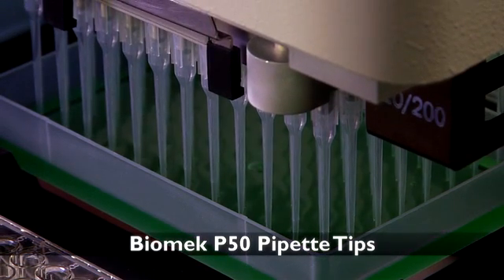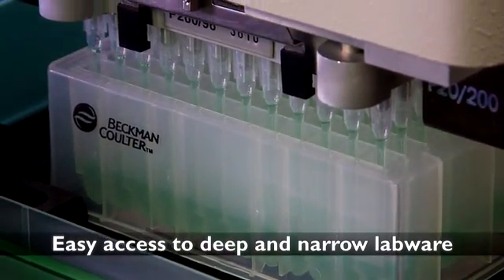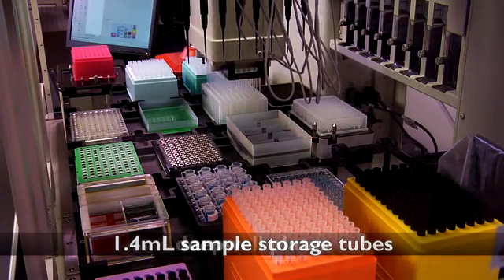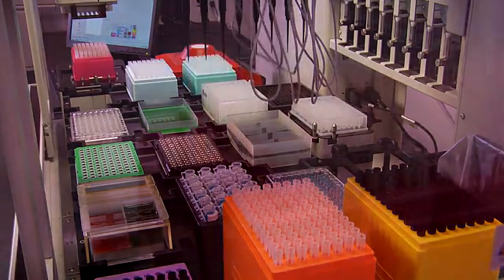The Biomech P50 Pipette Tips feature an extended length tip with a fine point that enables easy access to deep and narrow labware such as microfuge tubes, 1.4 milliliter sample storage tubes, and deep well plates. The Biomech P50 Pipette Tip design enables you to recover more of the sample from these deep labware and tubes.